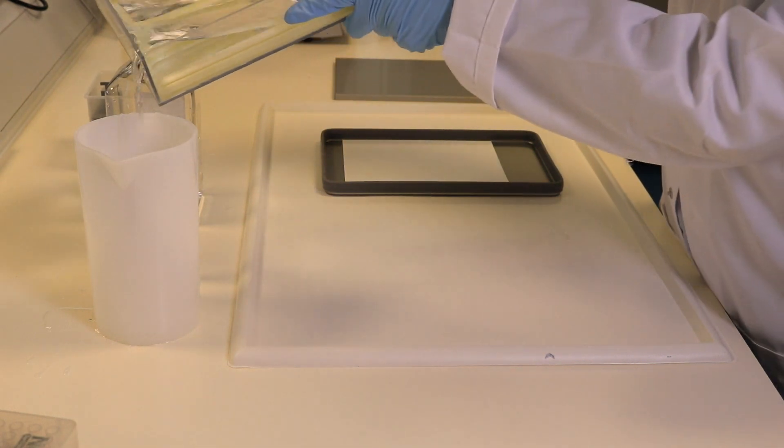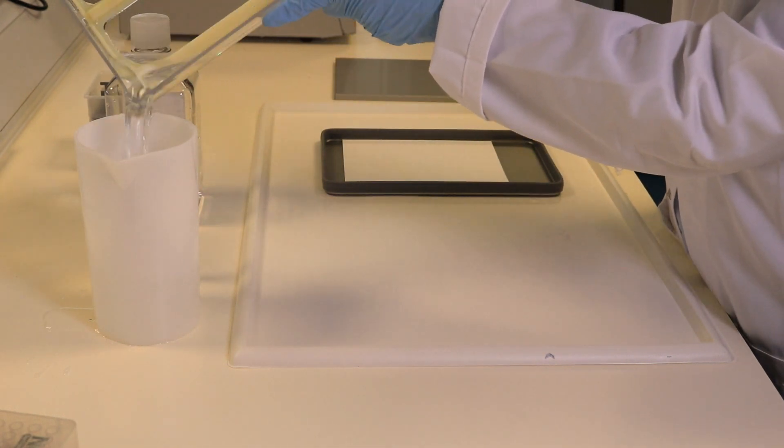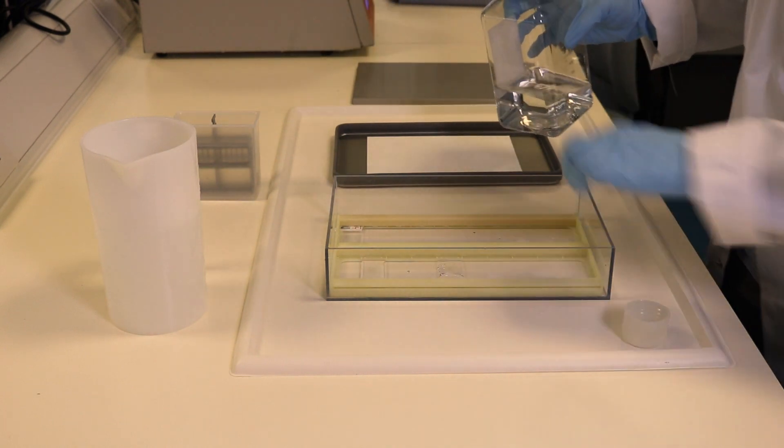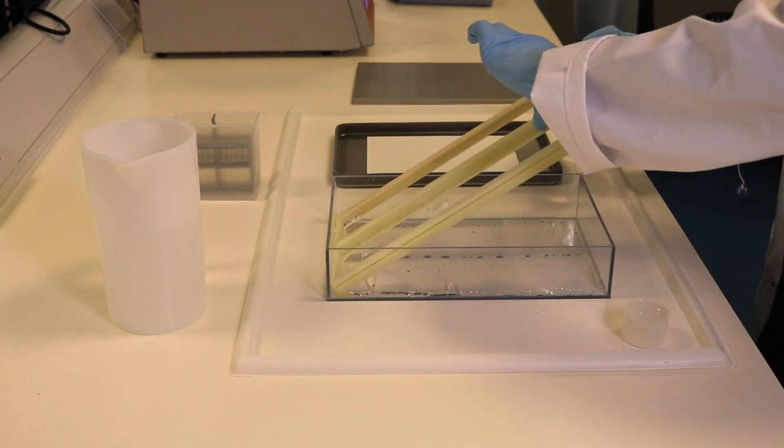Pour away the buffer while holding the slide holder in place. Renew the buffer while lifting the slide holder to avoid sample disruption. For more information, see below.